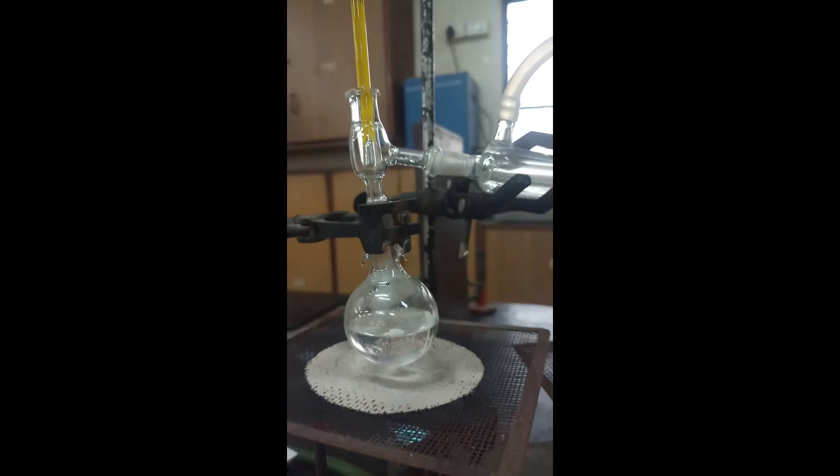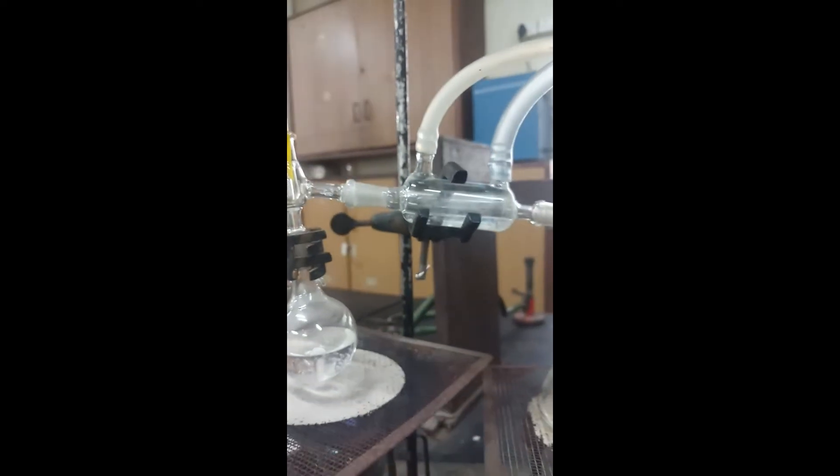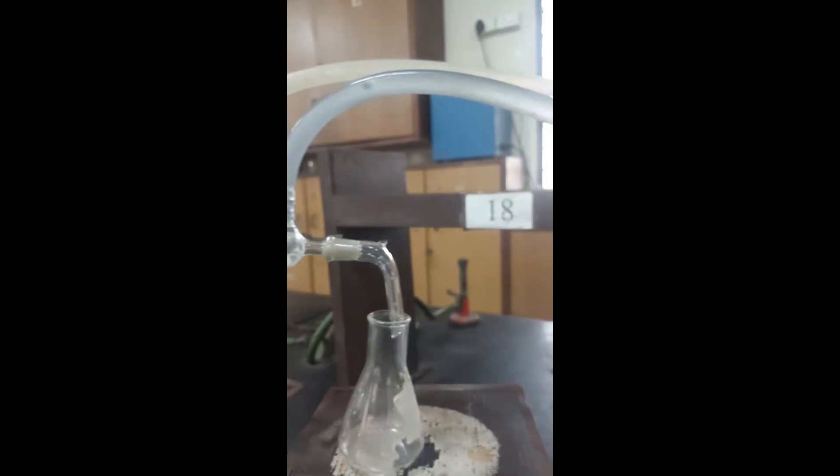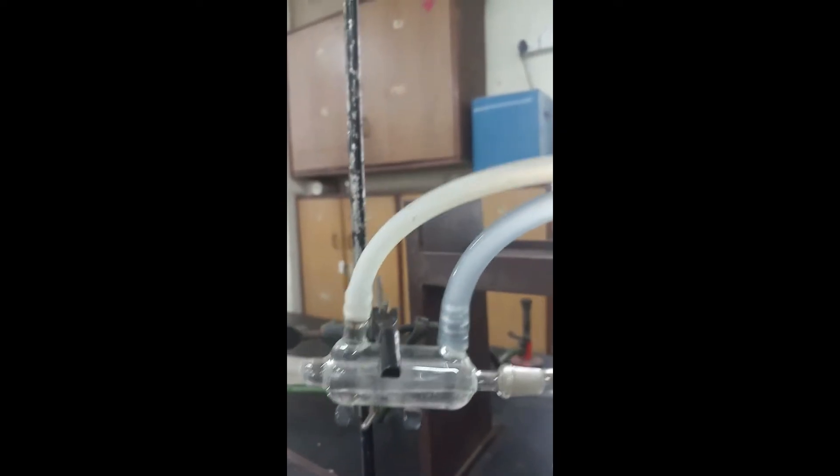This is the entire setup assembly for the distillation unit. This is the pipe for water circulation through the condenser. This is the inlet pipe, whereas the outlet pipe for circulating cold water for condensation.